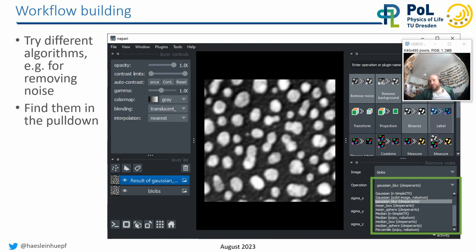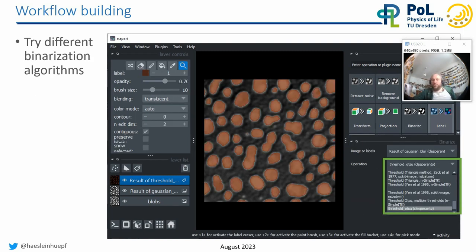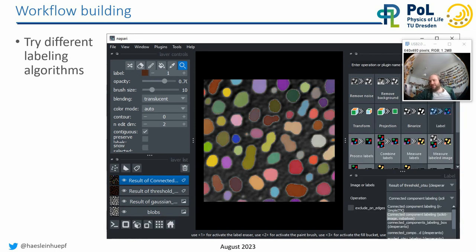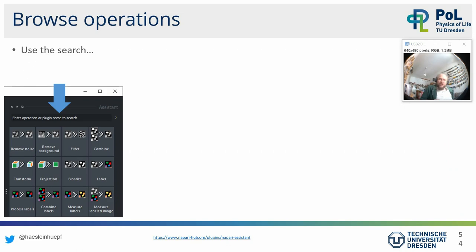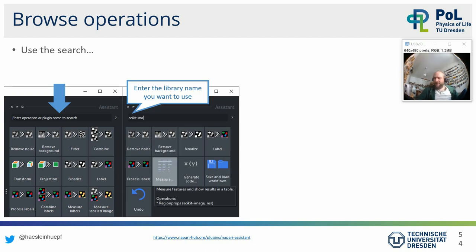If you don't know which category your algorithm belongs to, there's a search field. For example, entering 'scikit-image' shows only operations implemented in that library. I also recommend writing biological terms in there — for example 'membrane' for membrane-based cell segmentation. If you're a plugin developer, this only works if you document in the docstring that your function might be useful for that specific task. If no tool is found, you can search Napari Hub, image.sc, or the BioImage Informatics Index — ten additional search buttons pop up.